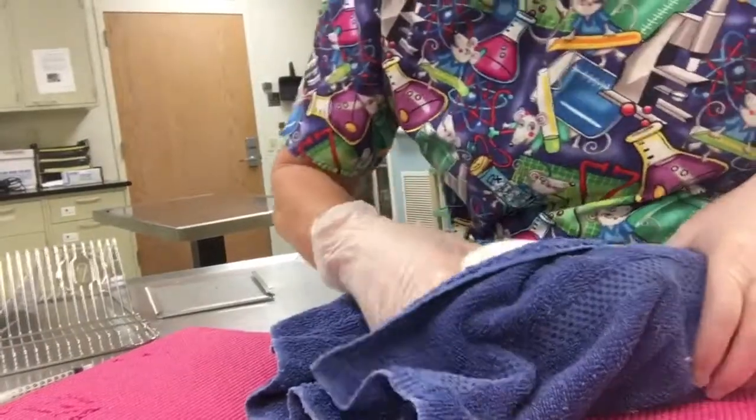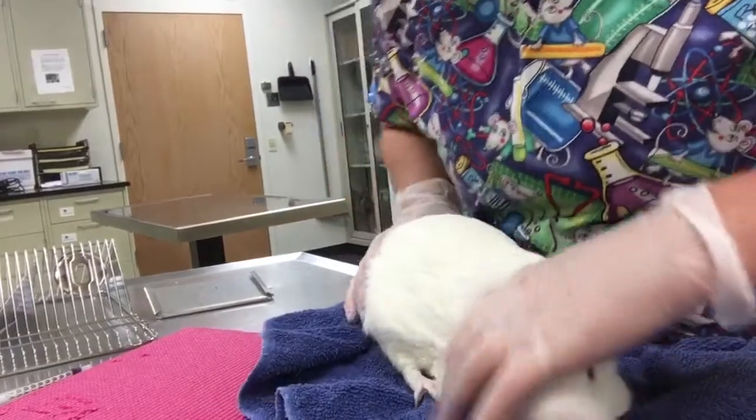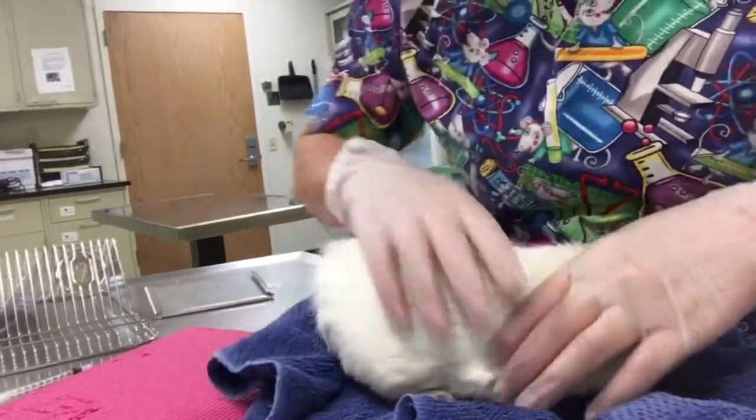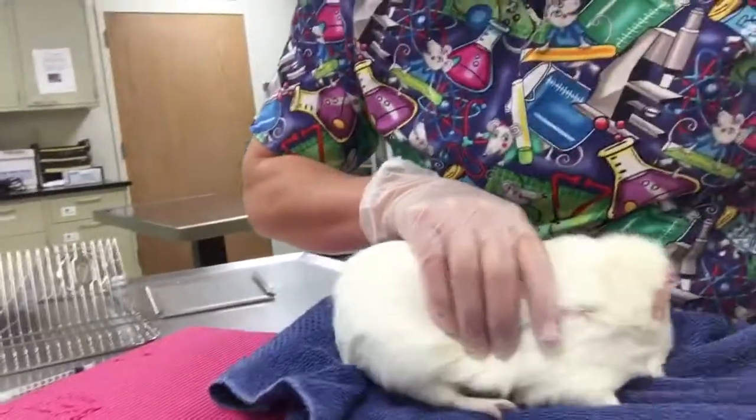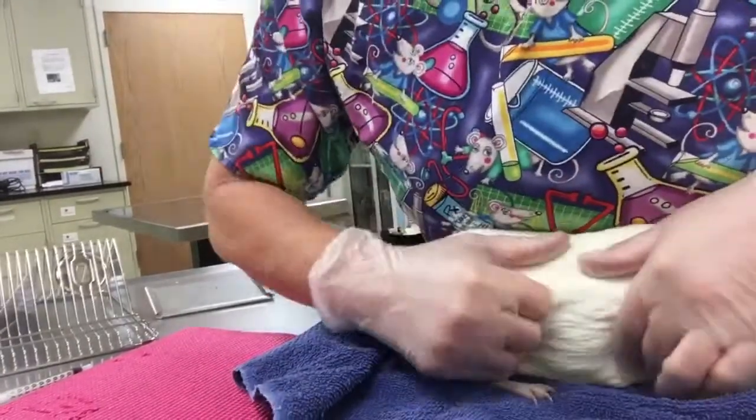To complete an ID injection on this guinea pig, same thing — you could use the towel to cover up the front and back half. For my purposes, I want to show you what I'm doing a little more, so I'm going to bring him very close to me.